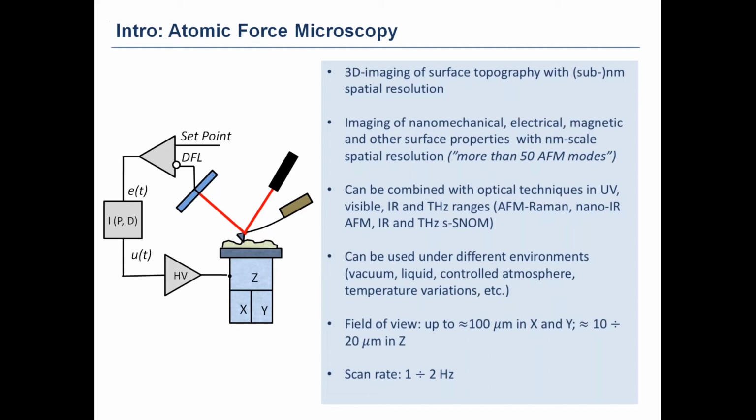Since its introduction, AFM has become widely spread, and at the moment there are a lot of commercially available instruments on the market.